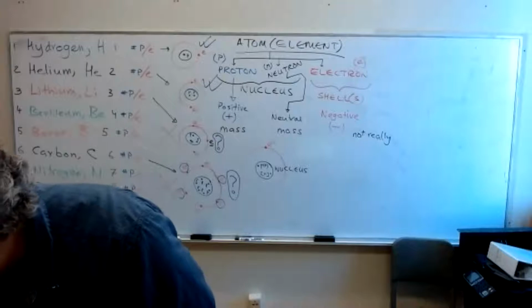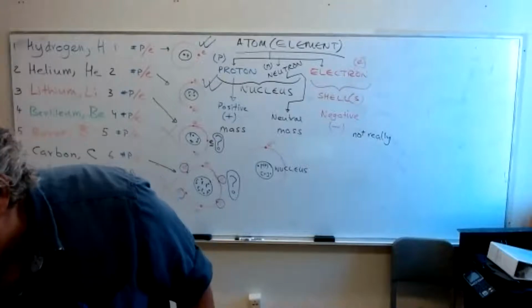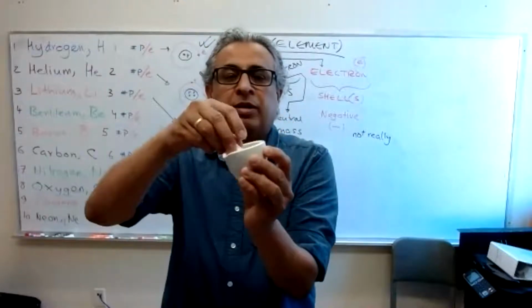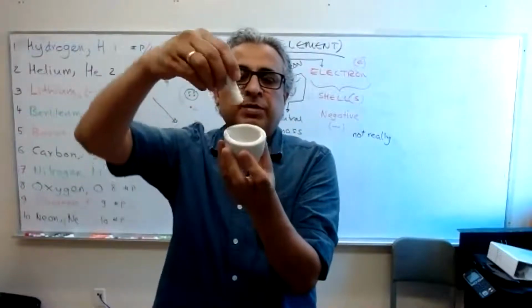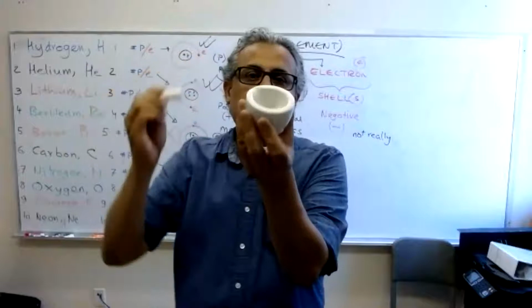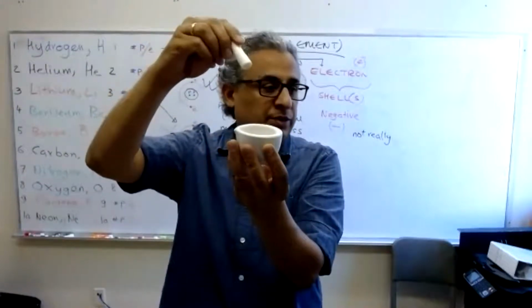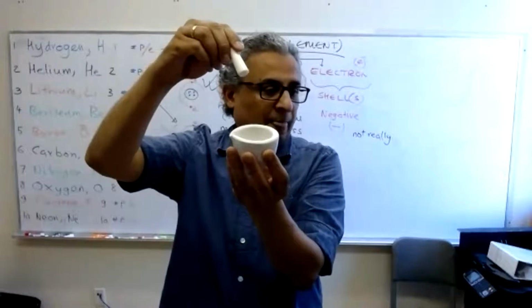What else? I have shown you the syringe. I've shown you that. This is called, you have seen it in the kitchen, a mortar and pestle. What's the purpose of using this? Mortar and pestle. Why do you use it? Question.